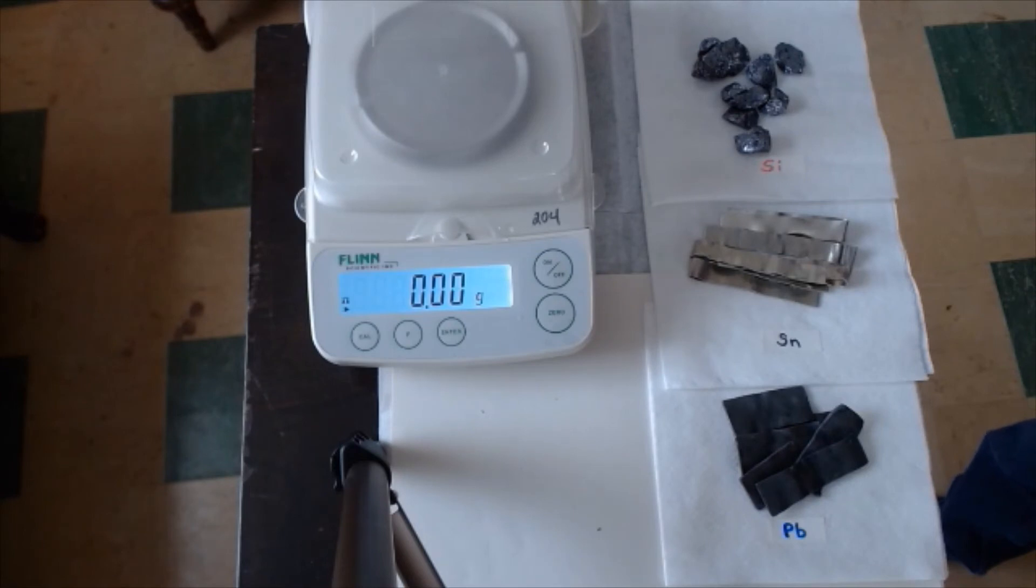We've done this before, so it shouldn't be too new. We've done a volume displacement lab earlier in the year, where you calculate a density from mass and the net volume of the material that you're trying to find the density of.